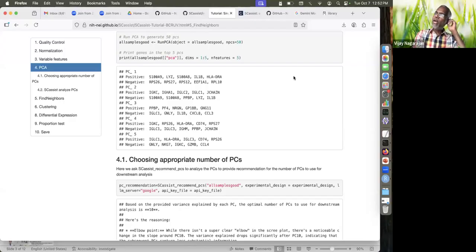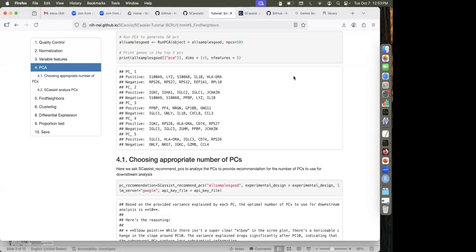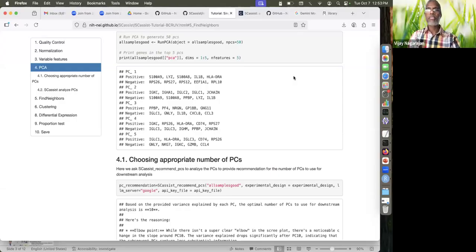So I mentioned RAG, but we're not even using RAG. What we're doing, the main idea, is augmenting the prompts with metadata that we compute, right? And that's the only trick here. We take relevant metadata, hook it up to a single cell Seurat object, generate metadata, augment the prompt, and use that augmented prompt to query the LLM. So that is the main brain.